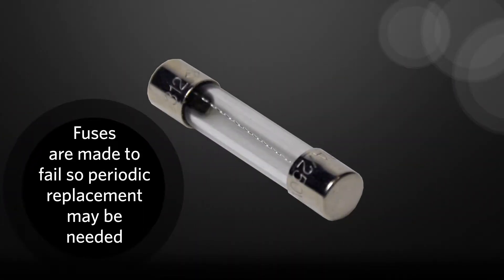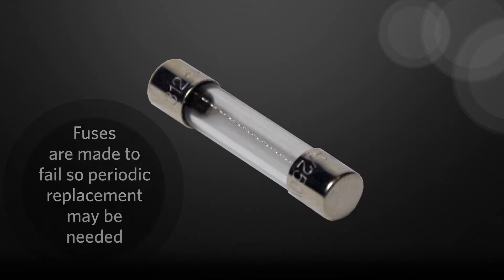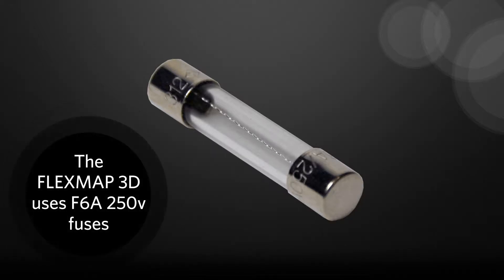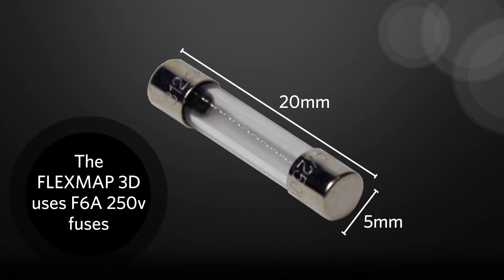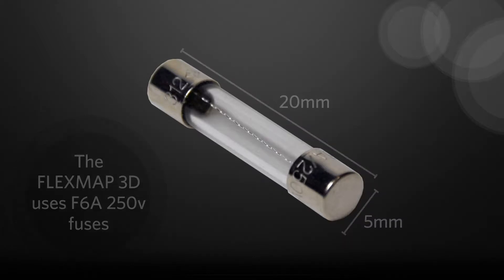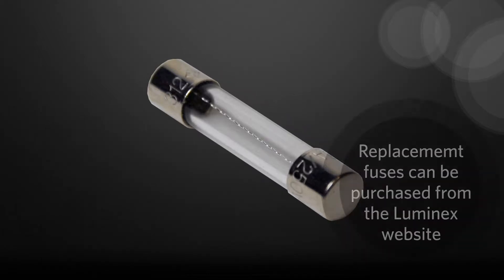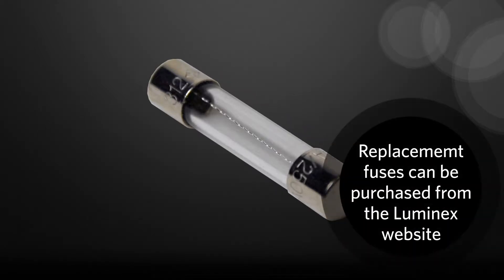The FlexMap 3D instrument uses F6A 250V fuses that are 5mm wide by 20mm long. Replacement fuses can be purchased from the Luminex website.